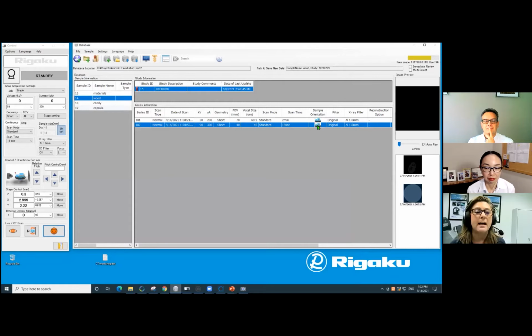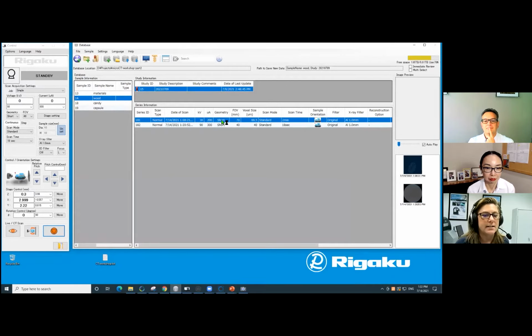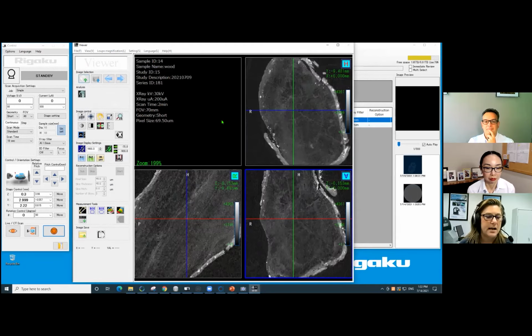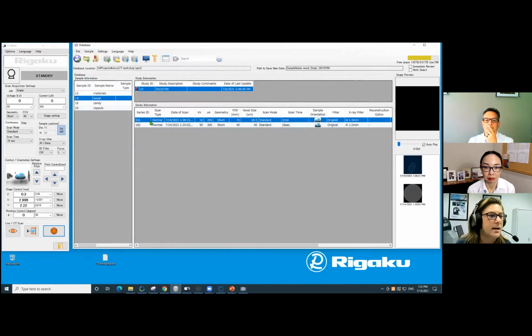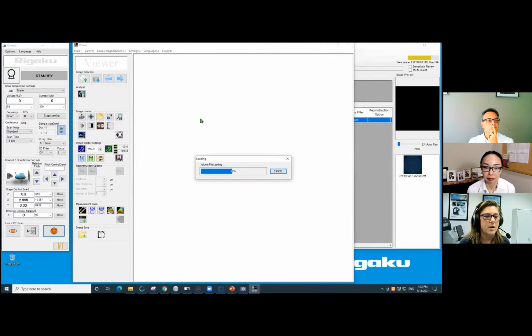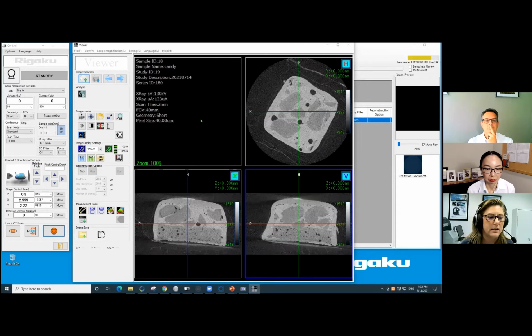Well, what would it have looked like if the candy was inside? Just in case you picked one of the trick samples, I imaged this one previously. This is what the actual candy would have looked like. You have the chocolate exterior, some peanuts inside, the nougat material and caramel, and you see a lot of voids.